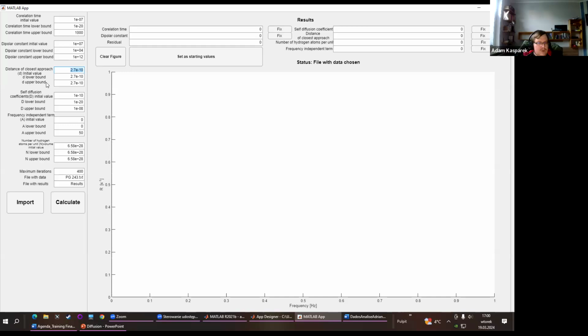And frankly, sometimes when we are not sure what to put here, then we simply fix this result to 2.7 multiplied by 10 to the minus 10, so in other words, 2.7 angstrom. Okay, and now here I can put it free. I'm sorry. Let's say 1 nanometer. It's very, very big.